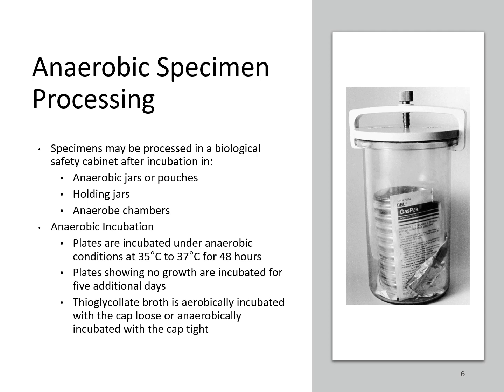And you can do this same process with bags to put these cultures in. So depending on the lab and the amount of organisms or cultures that they get for anaerobes will depend on which method that they use. A lot of labs will just use the anaerobic bags. Once they're cultured, those plates are incubated with those anaerobic conditions for 35 to 37 degrees Celsius for 48 hours.